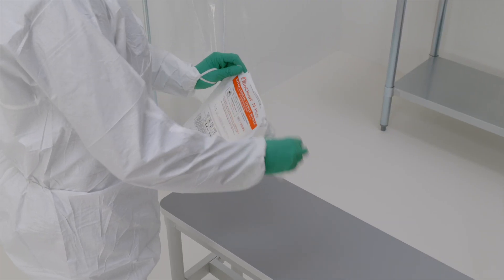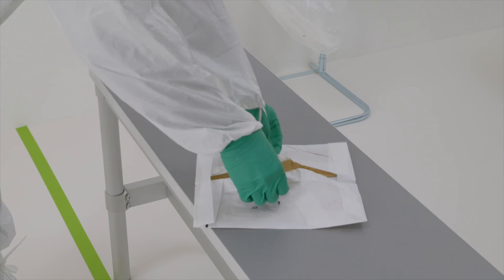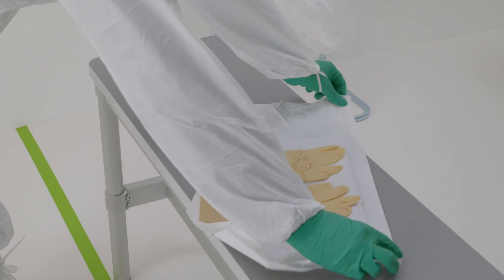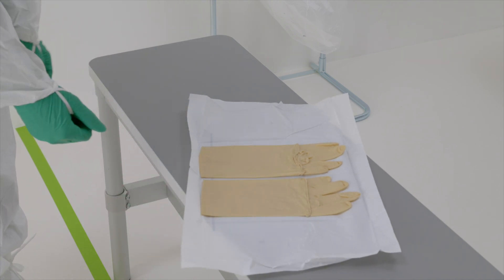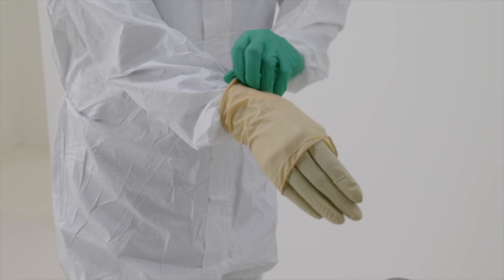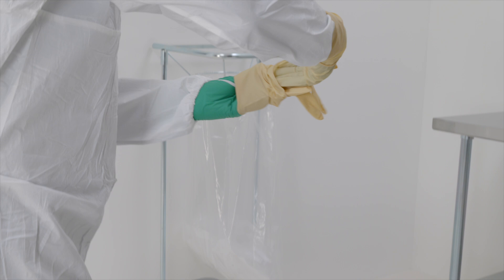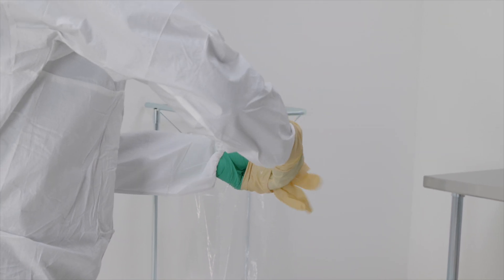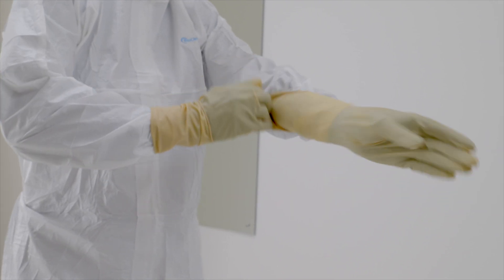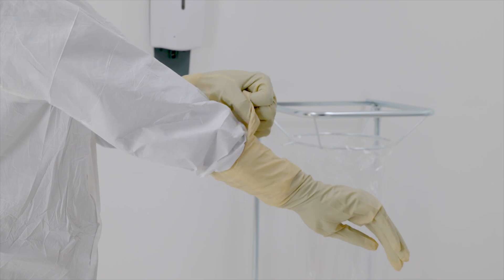Retrieve the outer glove. Grip firmly at the folded cuff and slide the other gloved hand into the outer glove. Pull the folded cuff towards the wrist. Slip the fingers of the sterile hand into the pocket formed by the folded cuff. Slide the other gloved hand into the sterile gloves and unfold the cuff over the sleeve. Use the sterile hand to unfold the cuff of the first sterile glove until it overlaps the sleeve.